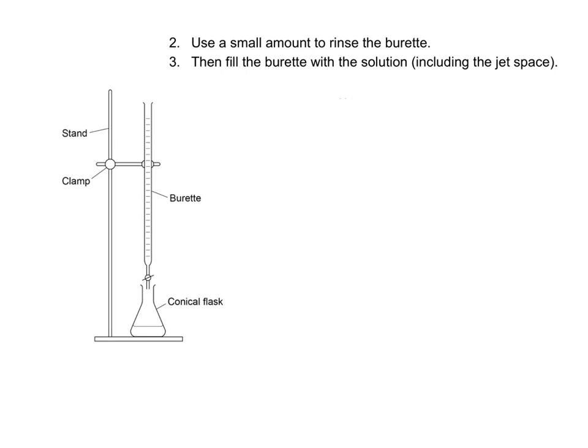Use a small amount of the solution to rinse the burette. You then need to fill the burette with the solution. Use a funnel to do this to make it easier to pour in.